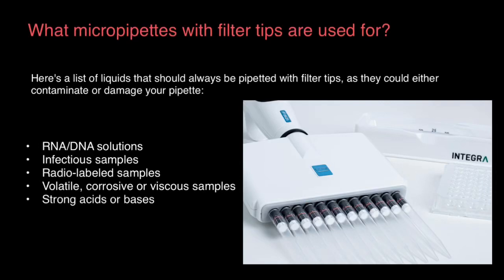Hello and welcome to Nikolay's genetics lessons, and today we are going to talk about what micropipettes with filter tips are used for. And you can see one of such examples on this picture here.